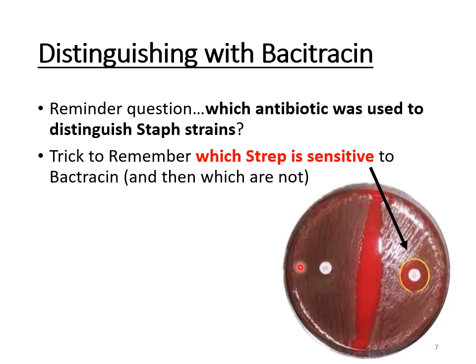The bacteria streaked where you do not see a zone of inhibition, where the Bacitracin has not killed off any of the bacteria, that would tell you that on this side of the plate is either agalactiae or E. faecalis. Both of them are resistant to Bacitracin. So if I ever asked you how you would want to identify if the patient has Strep pyogenes compared to the other two that we're dealing with today, one of the quick ways to distinguish pyogenes from the others is to do the Bacitracin test.